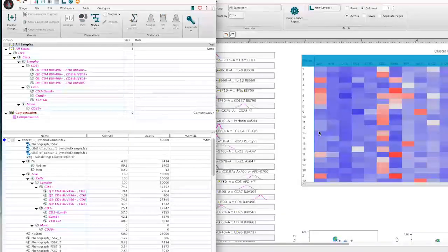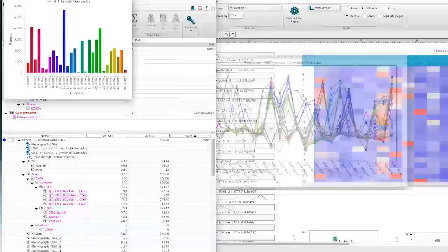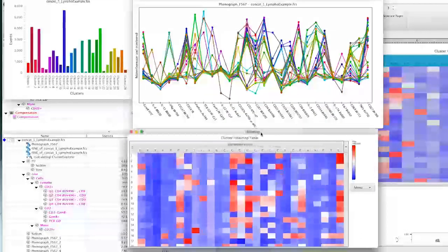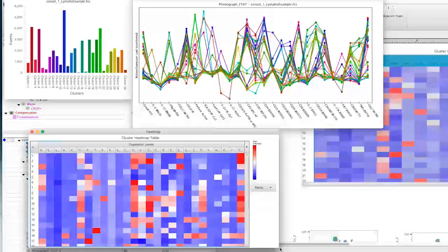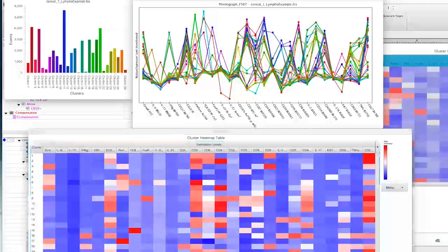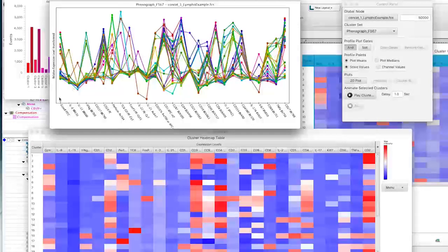All expression levels are relative because it depends on the fluorochrome you use and how bright that is in terms of the stain index. So one HLA-DR antibody is going to have totally different numbers underlying it for what's high and what's low, depending on its conjugation to a fluorochrome. So this says relative expression level transformed. And this basically means that we're using binned data here.